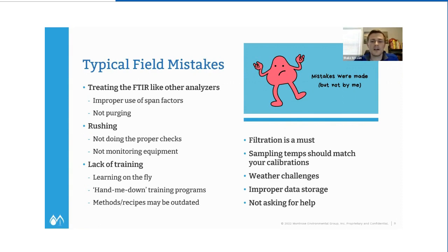And we'll talk about it a little bit more, but especially on the FTIR, if you're losing temperature on your lines, you're going to have really poor data analysis, especially with sticky gases.